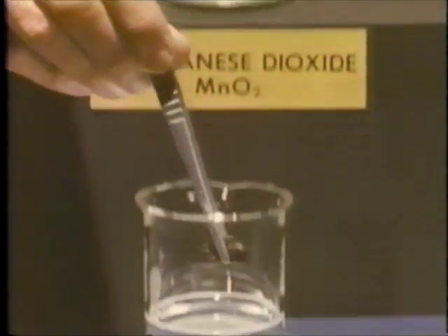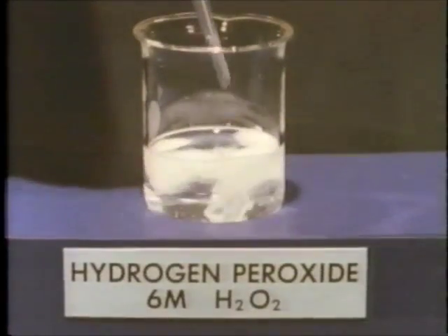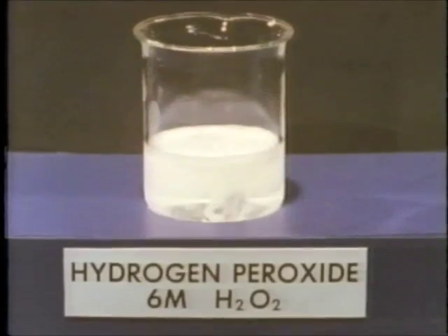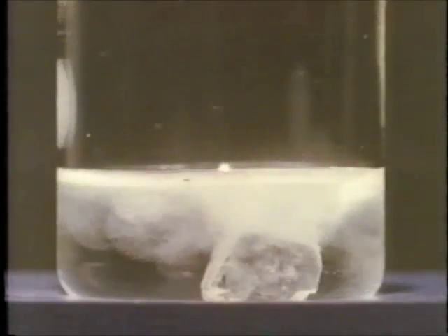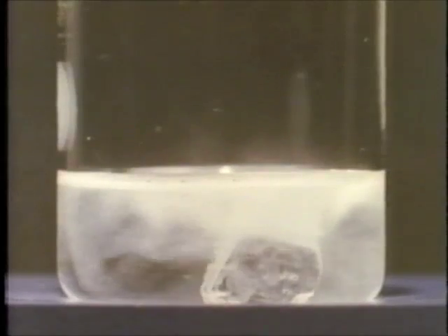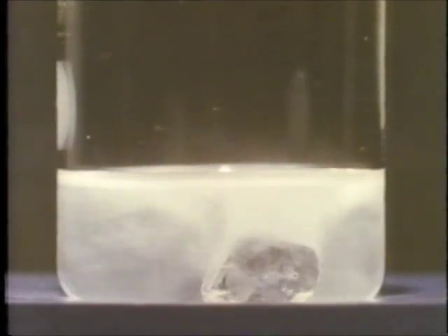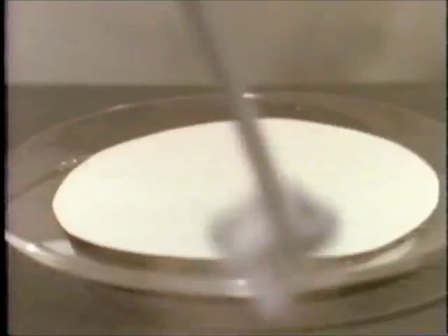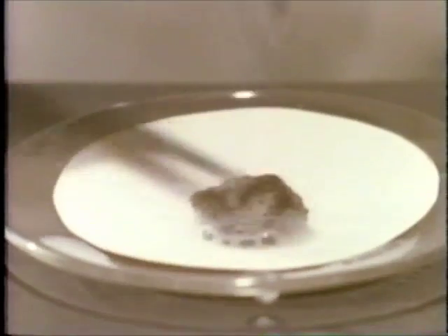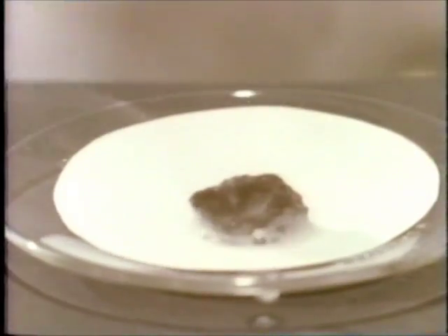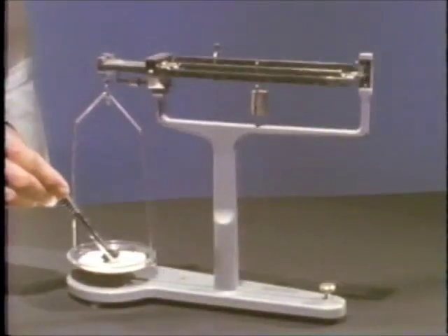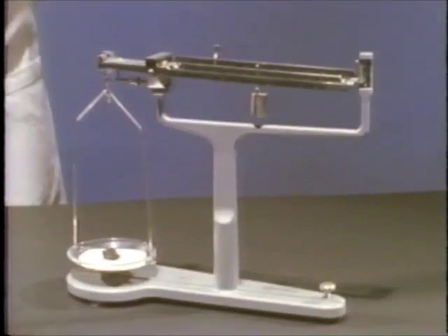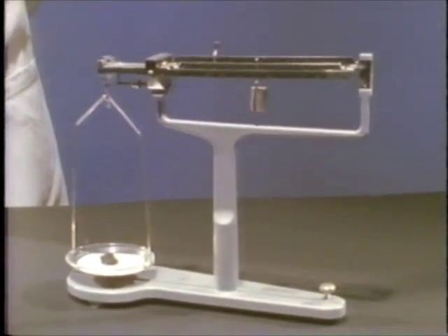Adding manganese oxide to hydrogen peroxide produces another rapid reaction. But unlike copper or sodium, the manganese oxide does not diminish in size. At least we cannot see any change. But let us check more closely to see if the solid is consumed in the reaction.